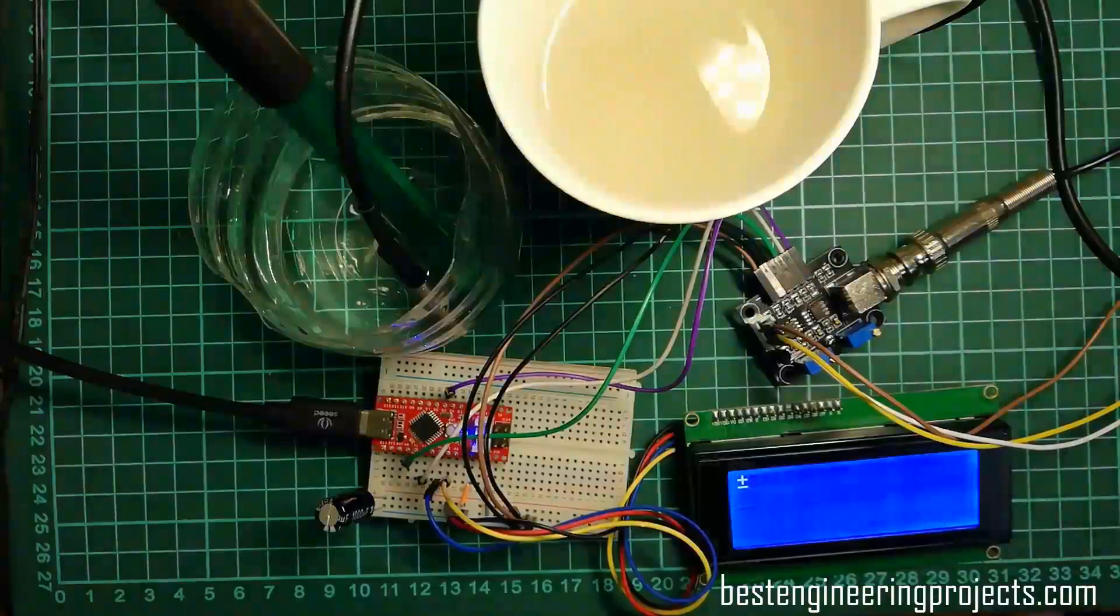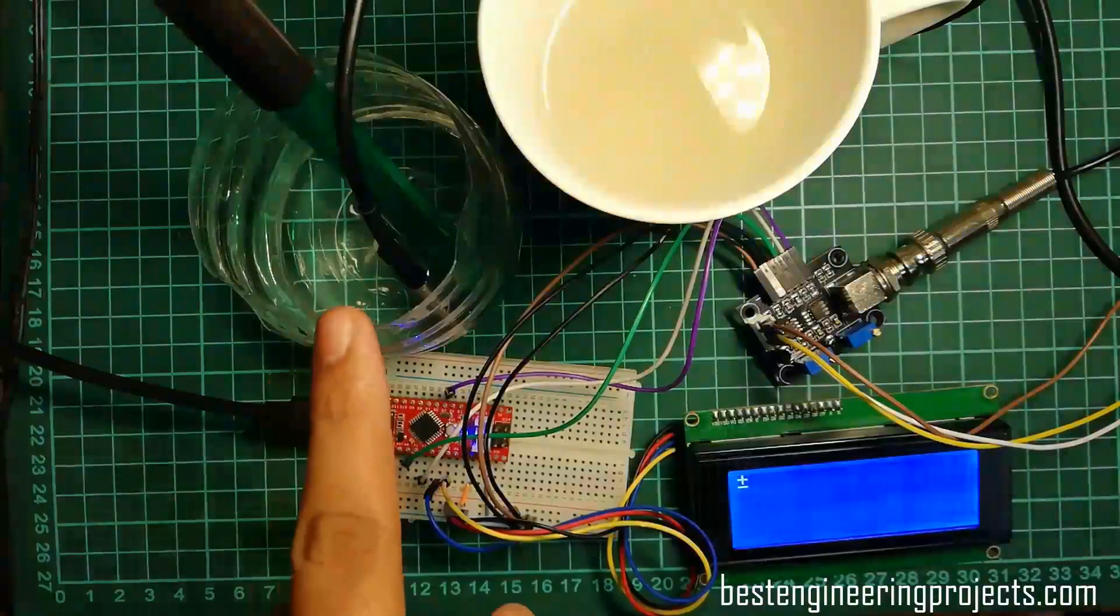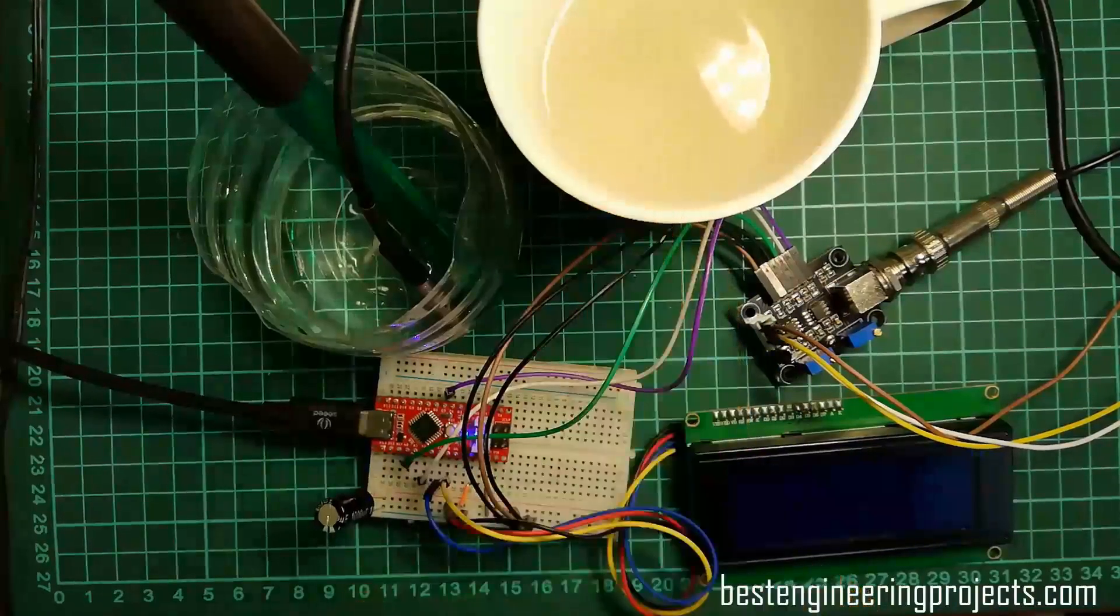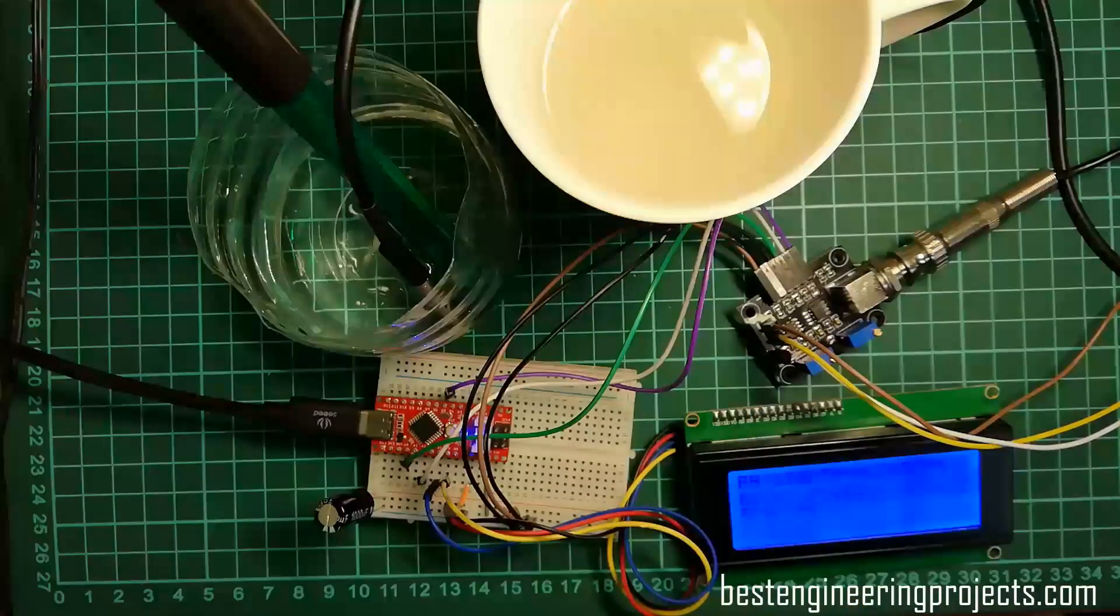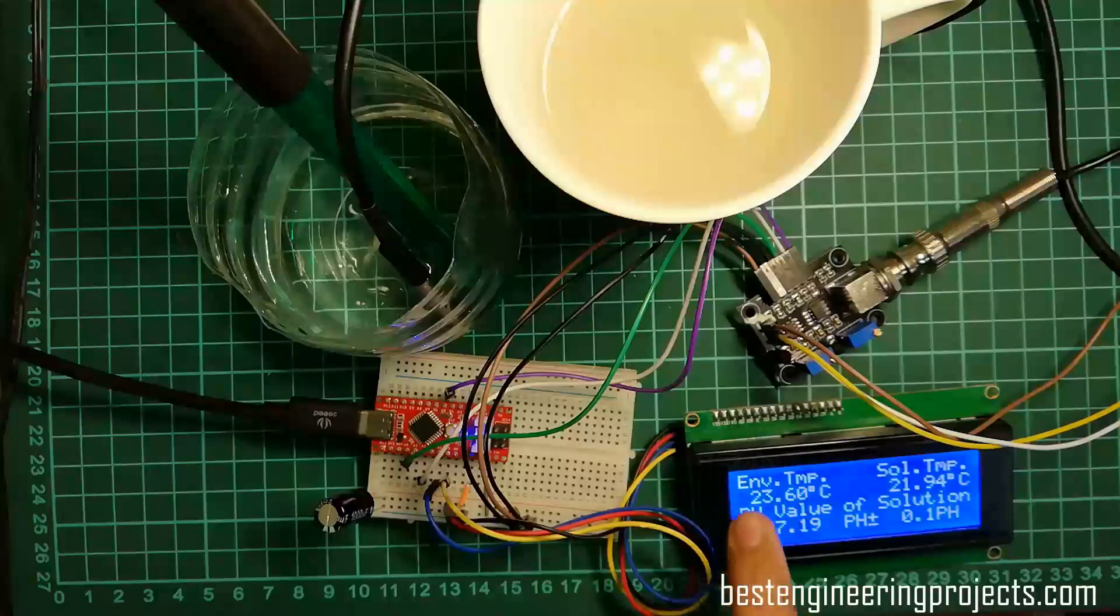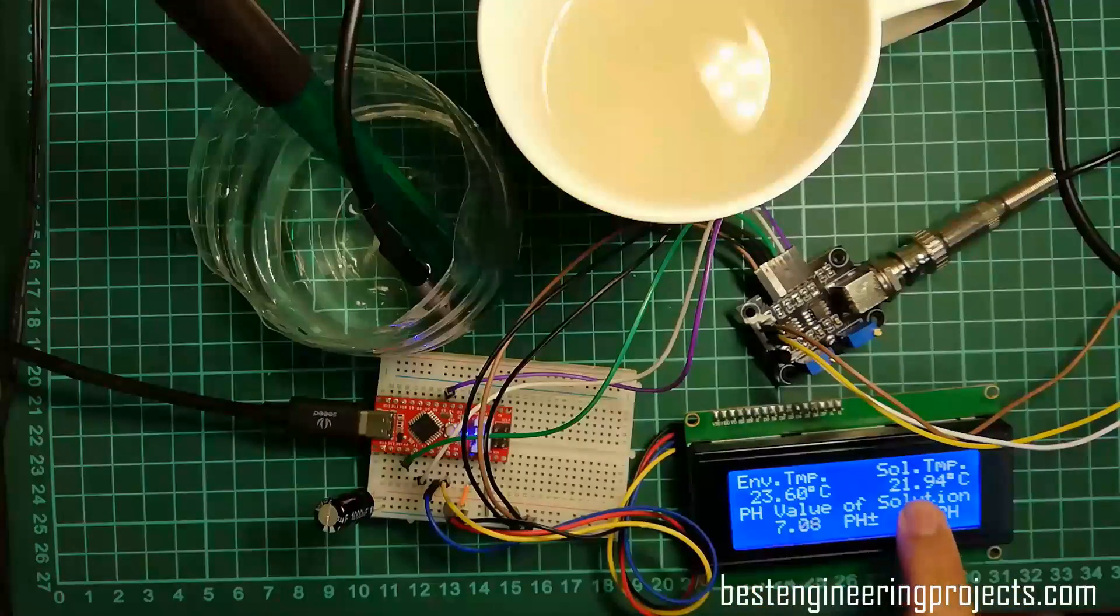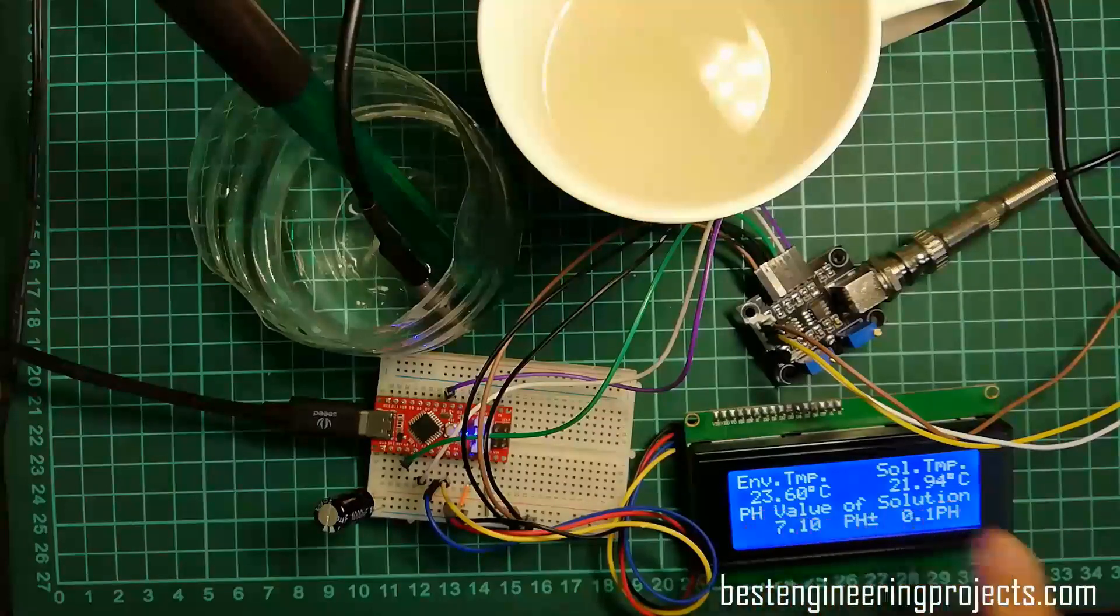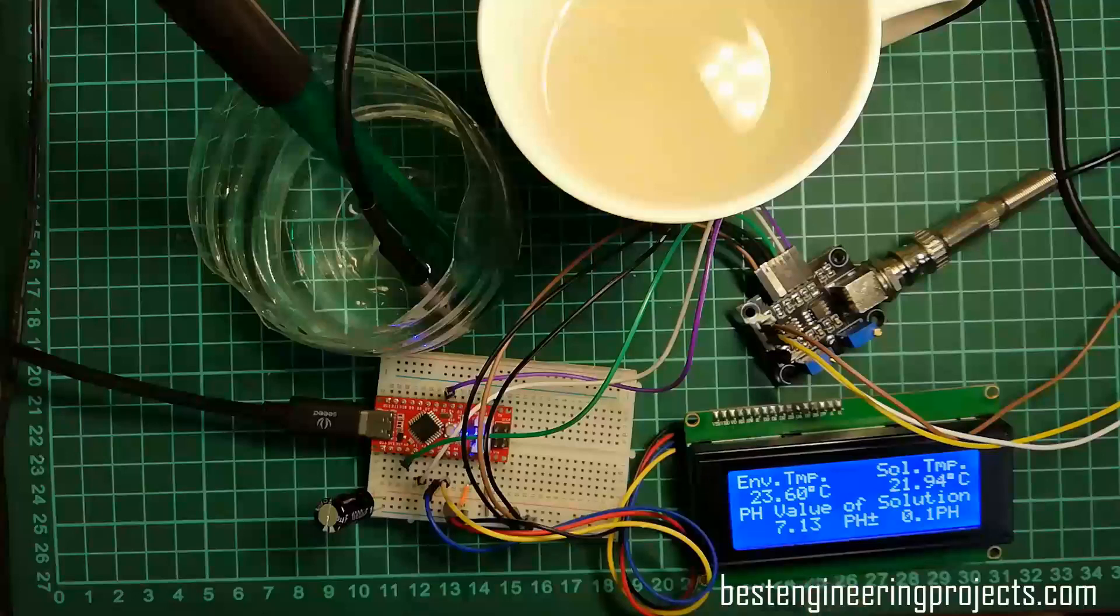Now, let's see the output of this project. Here, for demo purpose, I am going to measure the pH value of this water and pH value of lemon water solution. Download the code to your Arduino from the link in description section. As you can see here, environment temperature is about 23.60 degrees Celsius, solution temperature is 21.94 degrees Celsius. pH value of solution is 7.10 plus minus 0.1 pH. This 0.1 pH plus minus tolerance is due to the temperature difference between environment temperature and solution temperature being less than or equal to 5 degrees Celsius. It needs about 2 minutes to stabilize the reading.